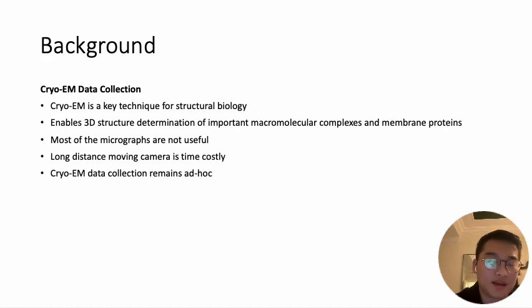So in the real world application, cryo-EM data collection remains ad hoc. This is because we don't have a very systematic approach to decide where we are more likely to find high quality holes. And it is not significantly better than random work on a large grid.